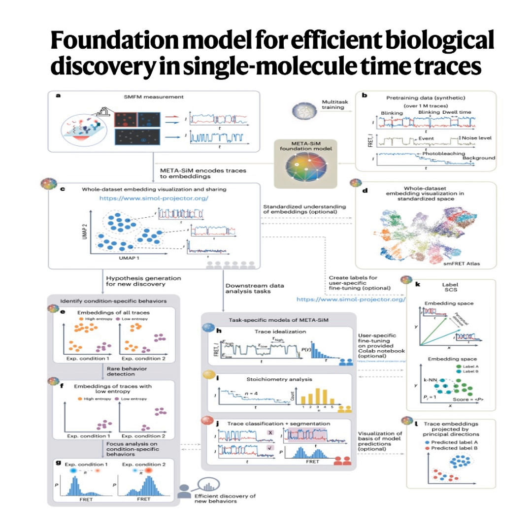You see these fleeting moments, these transient intermediates or rare behaviors, things that are completely washed out when you just average millions of molecules together, like in the old ensemble methods. Exactly, that power to see the individual story. It's fantastic, but it creates this enormous data problem, a real bottleneck. We're talking thousands, sometimes tens of thousands of these individual time traces. And analyzing that pile of data is often done by hand, it's slow, it's subjective. And you need some serious domain expertise to even begin to interpret it correctly.